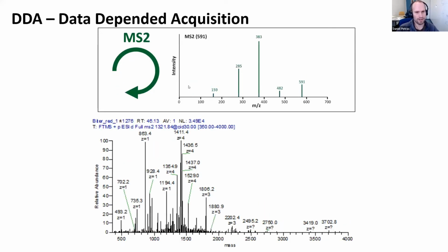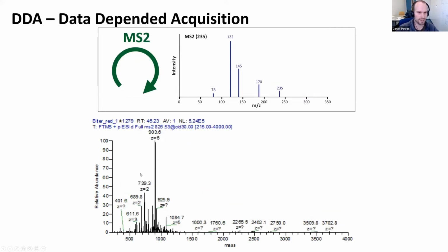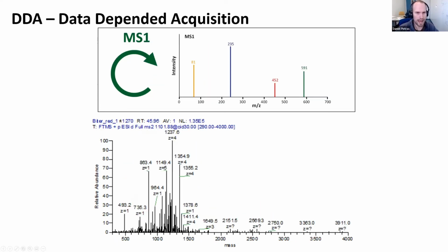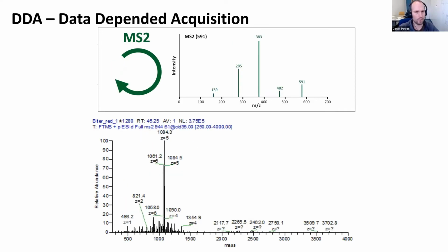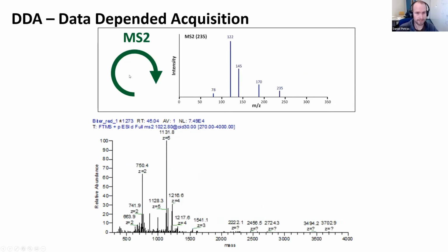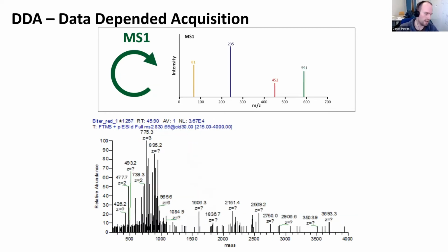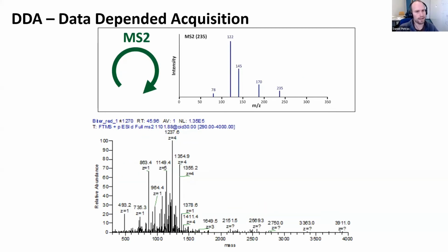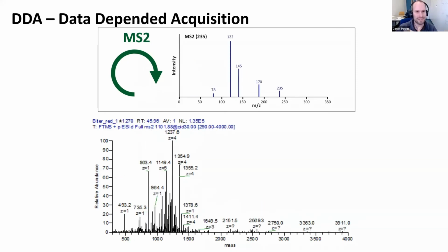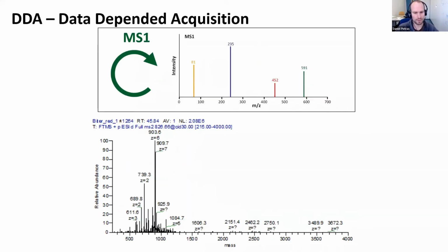In this animation it happens really slowly, so you can actually follow it. Looking at the bottom, this is just a GIF of a by now older generation Orbitrap, and this data dependent acquisition happens really fast. It's in the range of a second per duty cycle, right? So one of these cycles takes a second or so. You want to ensure that it's not too long in order to maintain enough data points for good chromatography. But then you get top 5 or top 10 or top 20 MS/MS spectra within each duty cycle. And this is directly coupled to the speed of your mass spec.